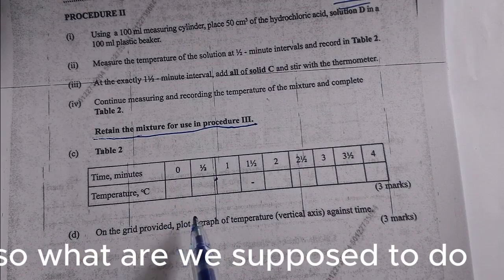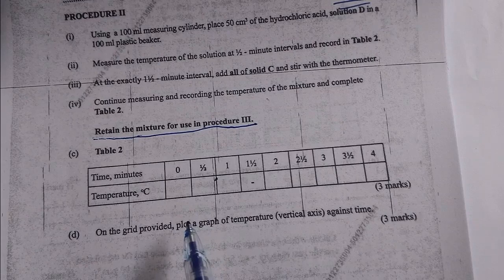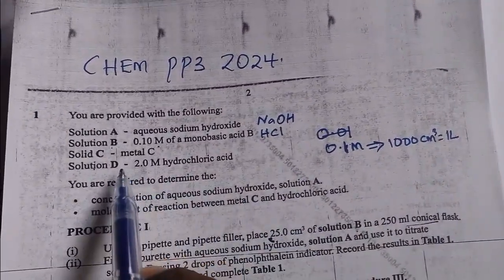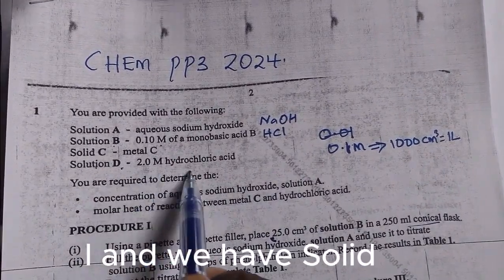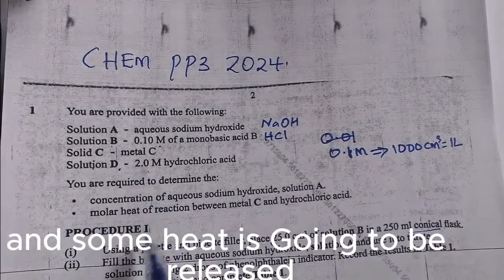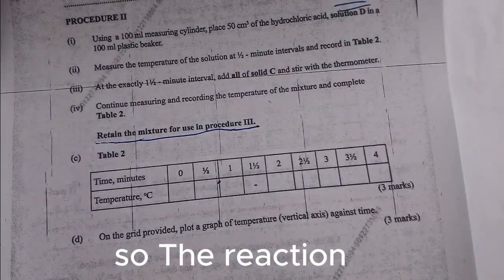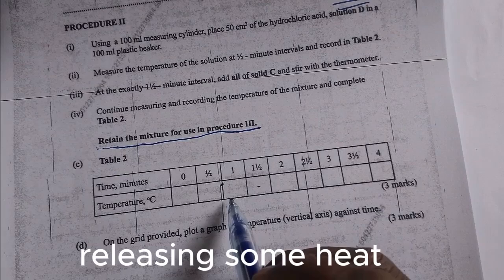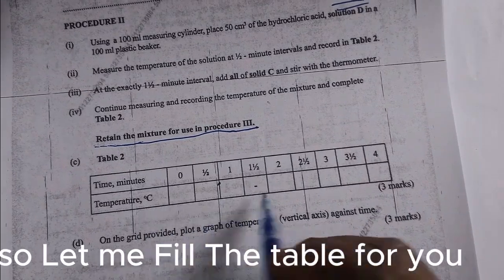So what are we supposed to do? Remember, we were given solution D, which is HCl, and we have solid C. So this metal is going to react with this, and some heat is going to be released. So the reaction was actually exothermic, releasing some heat. So let me fill the table for you.